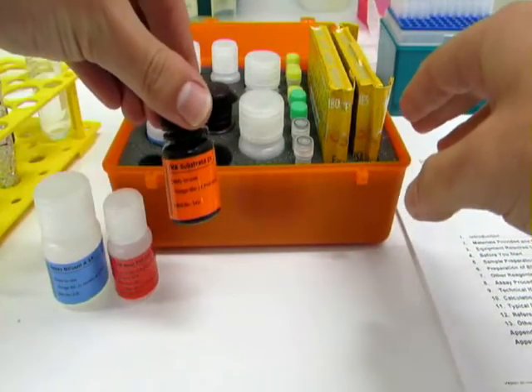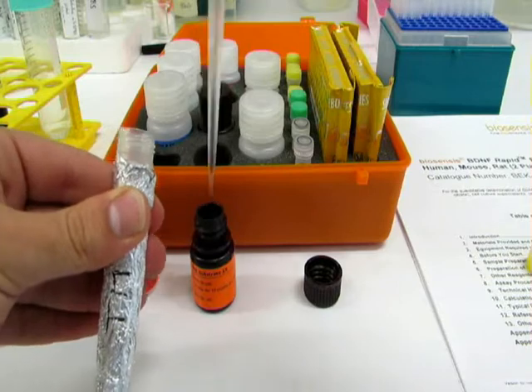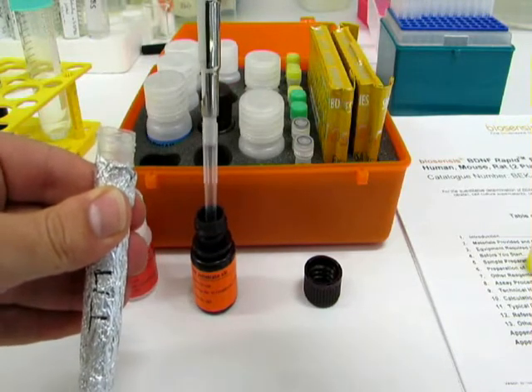Remove only the required amount of TMB substrate to prevent multiple warm-ups and cooldowns, and keep it covered in the dark.